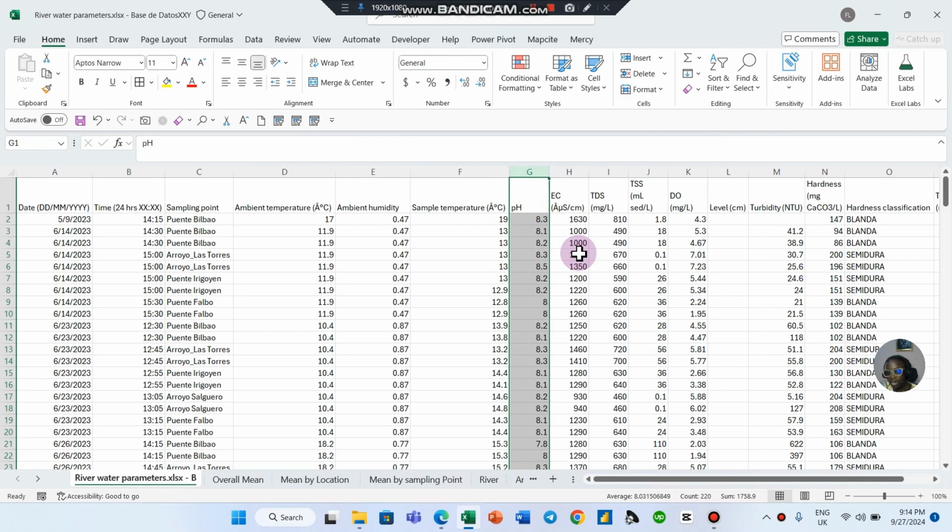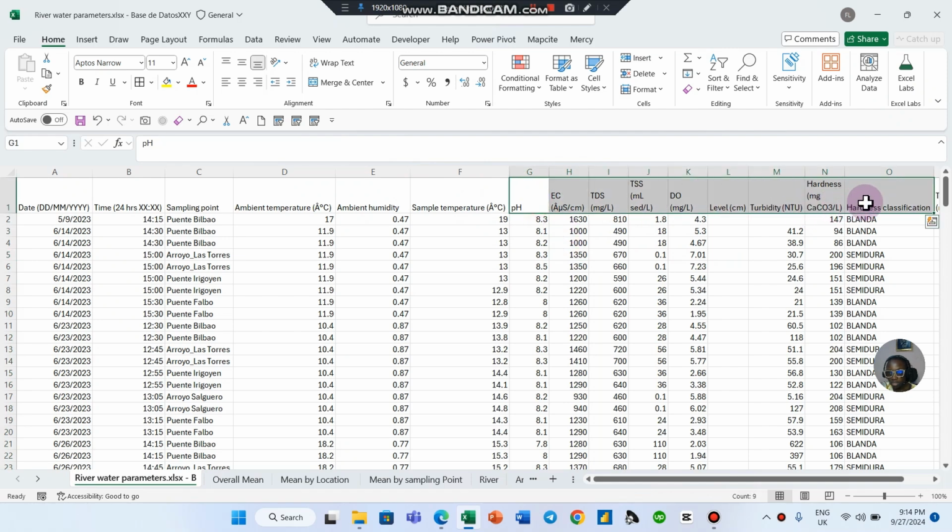We are not doing much in this video, since I don't have enough information on the acceptable range of all of these. But we know that to judge if it falls into the acceptable range, we need to find the mean first. So we'll be finding the mean, and I believe any student taking this class who has much more information about water samples can take the analysis higher and judge if samples from a particular location fall within acceptable limits.